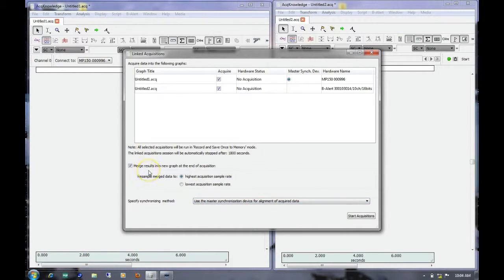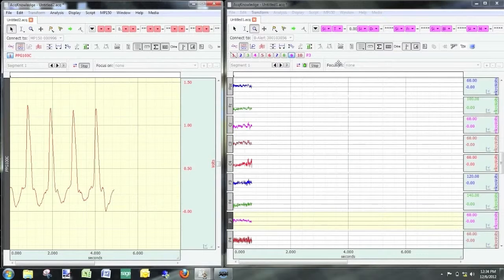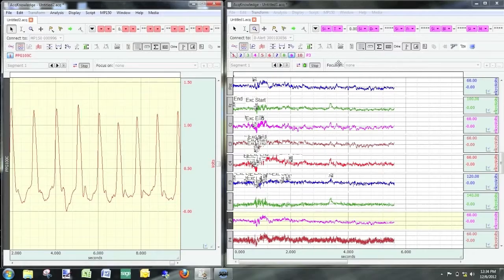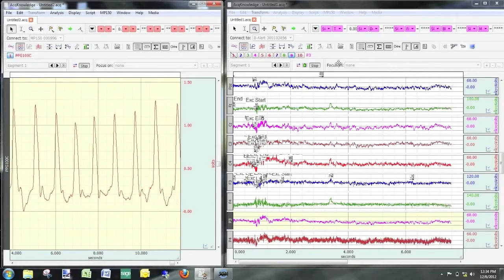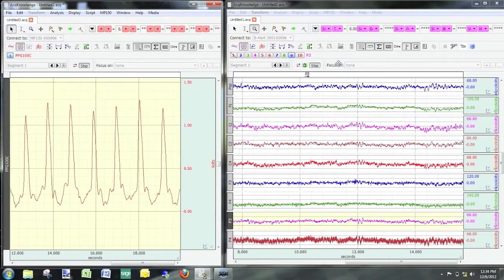Next, we can choose if we want to merge our results into a new graph at the end of acquisition. If this box is enabled, at the end of recording, both of our graphs will be combined into one merged graph window. You can then choose to merge it and resample to the highest or lowest sample rate. Once we've got everything set up to our satisfaction, we can click on Start Acquisitions. Now you can see that we're recording from both the MP150 system and the BeAlert system at the same time — the MP150 pulse data on the left and the BeAlert on the right.